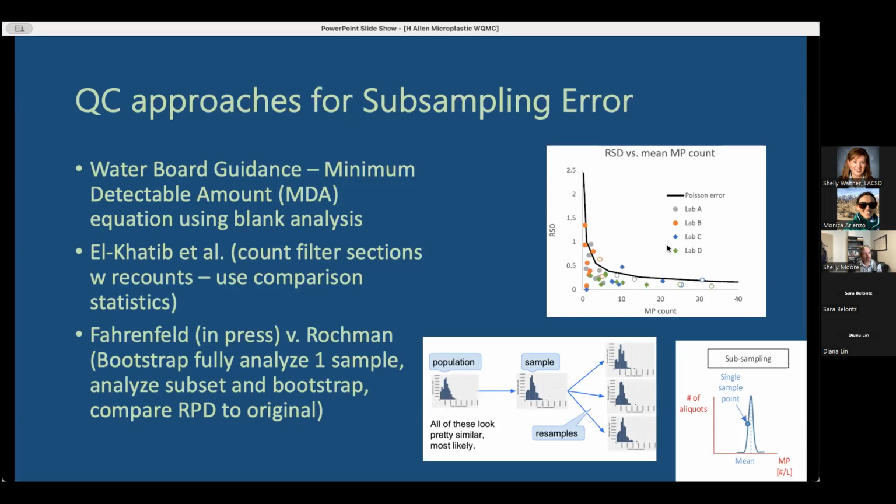It's counts from lots of different labs with the same standard, right? And the counts were all over the place. But interestingly, they follow this distribution. And counting studies are supposed to follow this distribution based on counting science for counting methods. We got this from asbestos, but there's a lot of other kinds of counting methods that rely on this known distribution. Again, if you're doing a quality assurance plan and it's a counting plan, you should understand that your data are likely to be in that Poisson distribution, at least the raw data are.